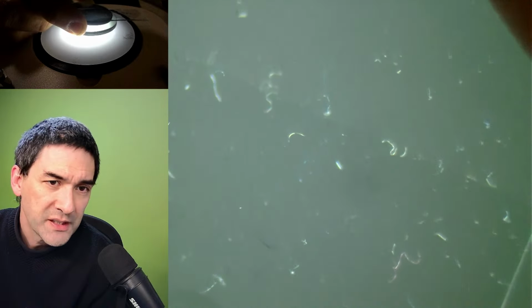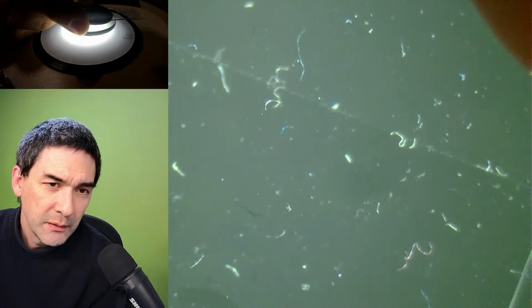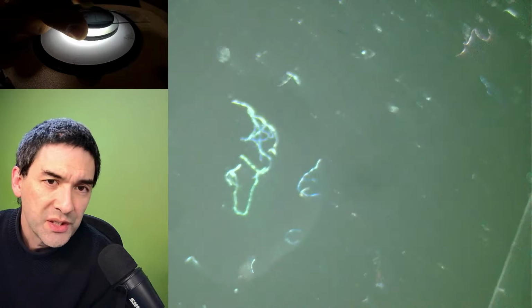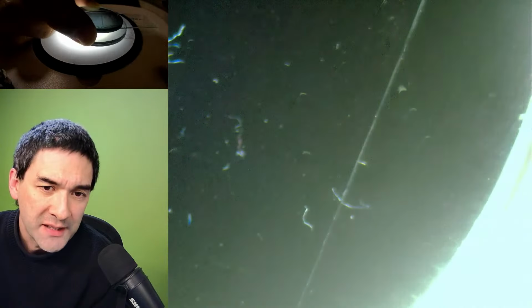Let's not forget that this is just a small sample, obviously. And those fibers here, if they're synthetic, of course, they constitute a significant part of the so-called microplastics problem that we're seeing nowadays.